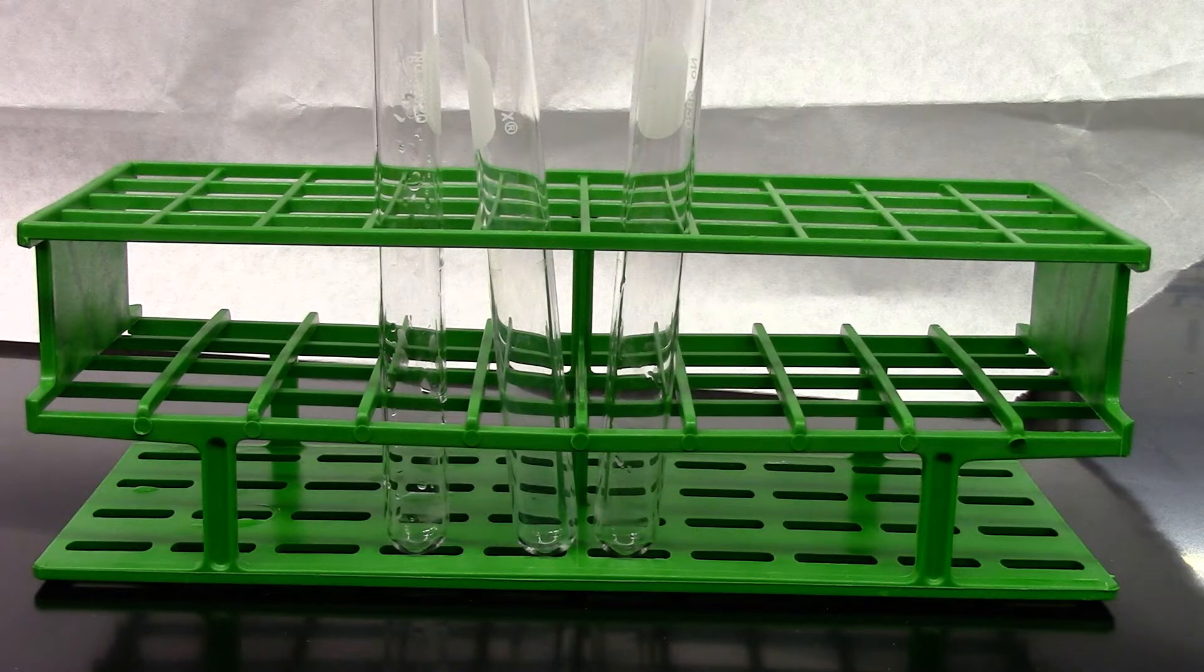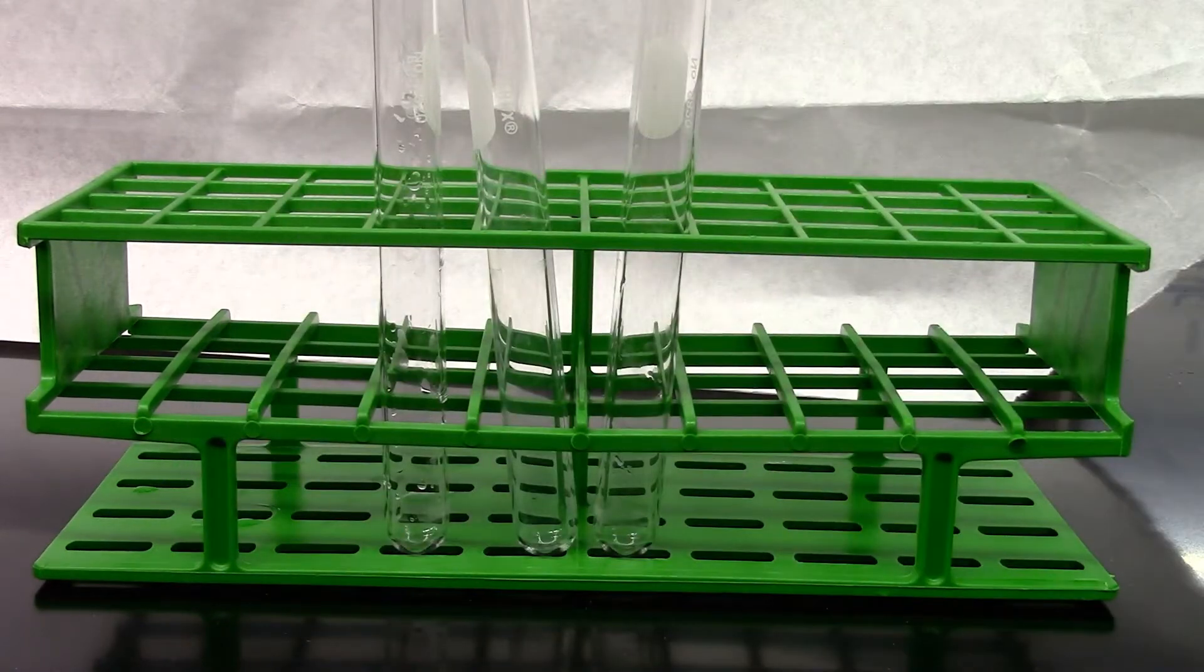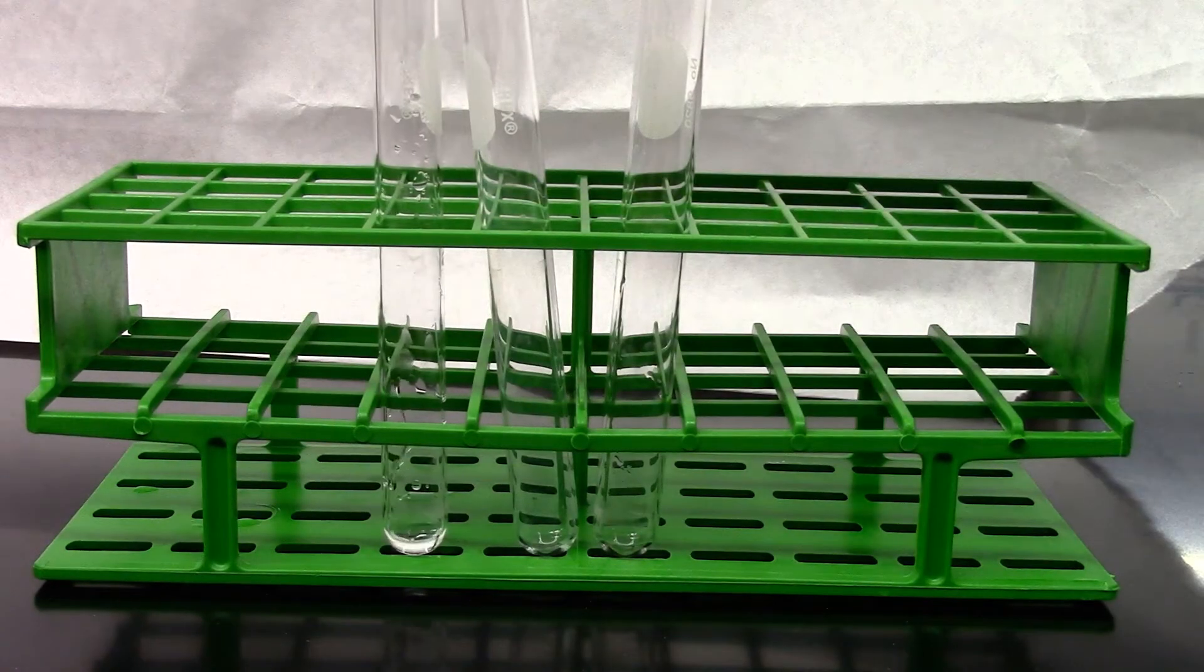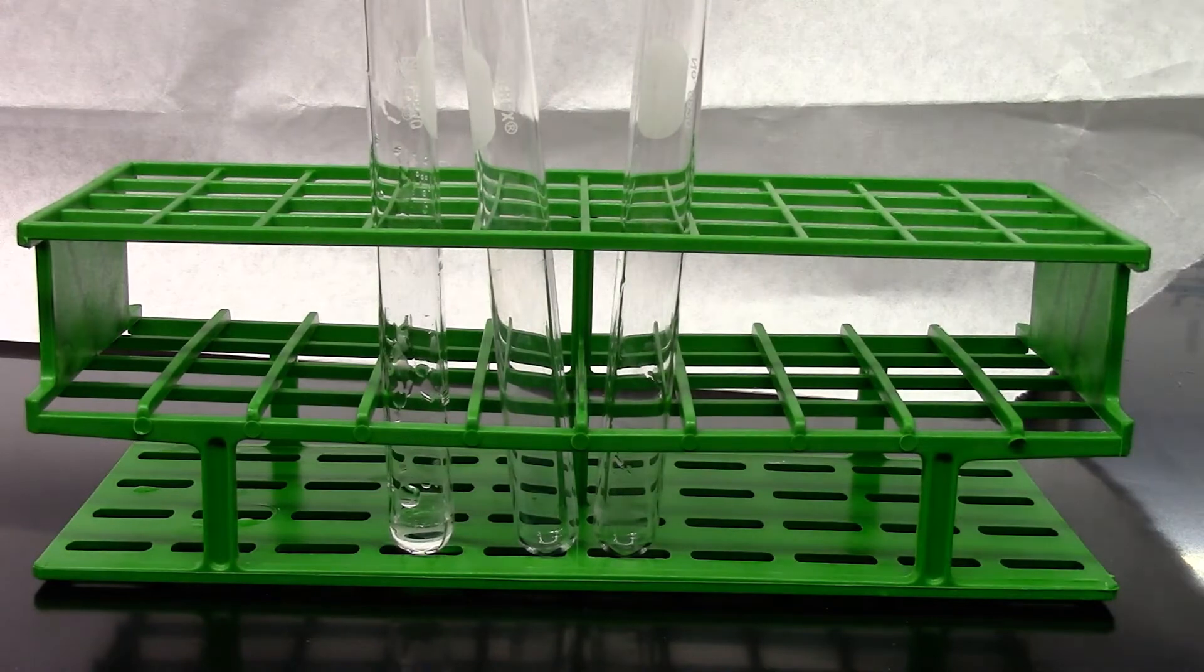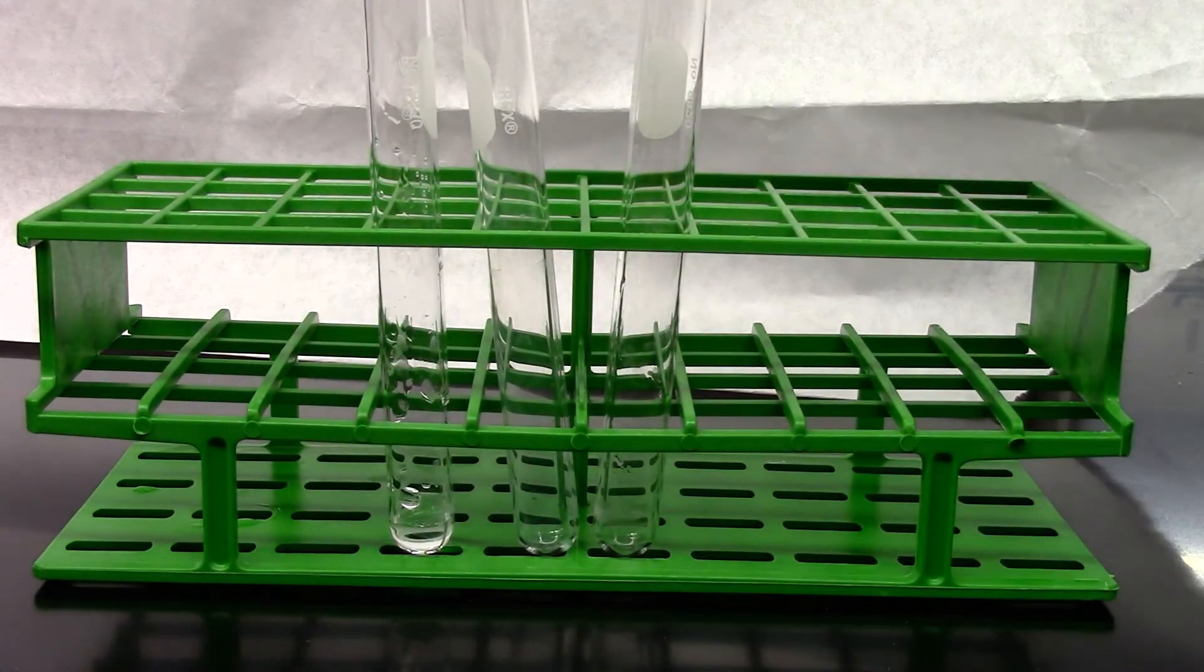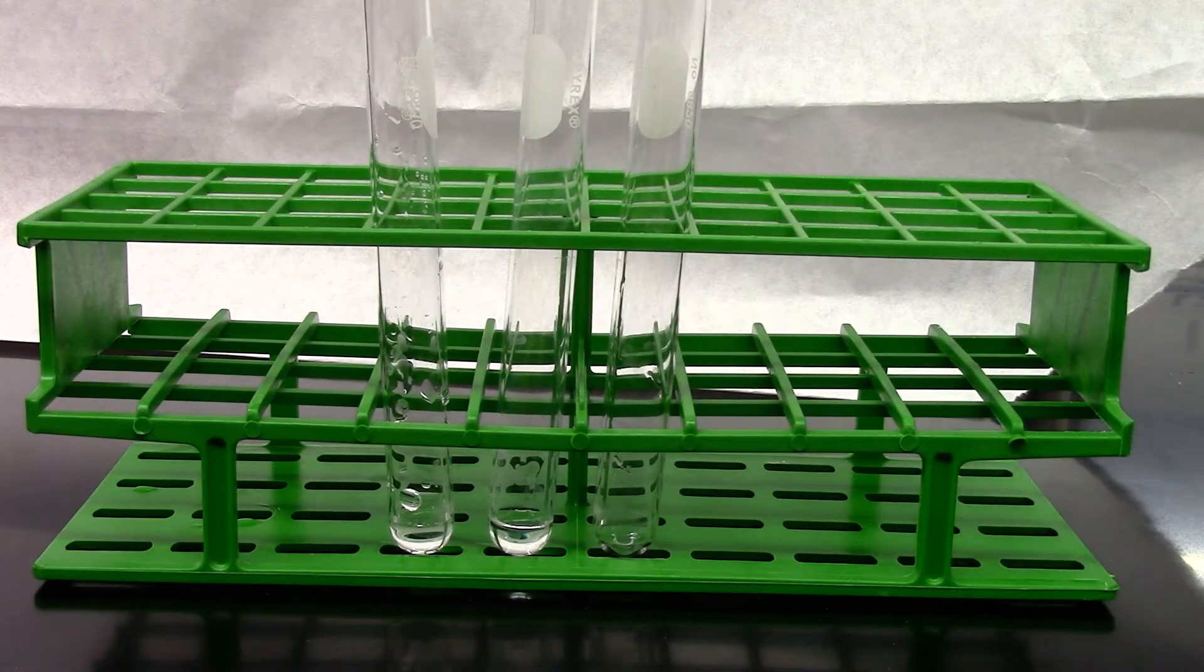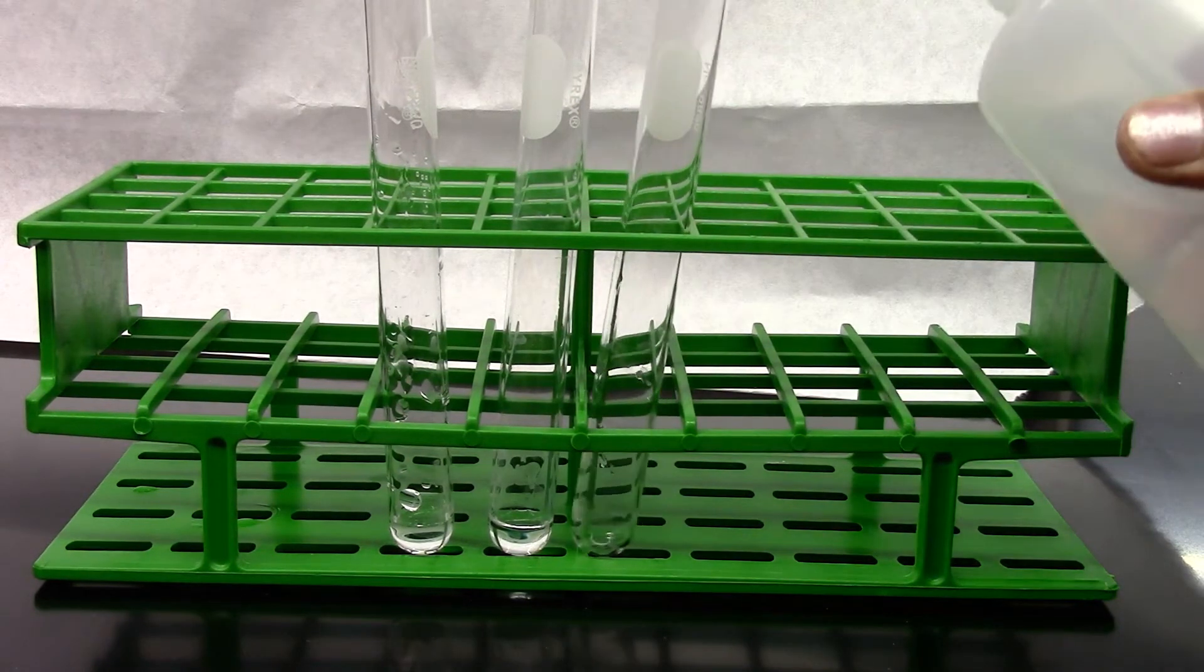So for part C I have three test tubes. The first one I'm going to add 20 drops of silver nitrate. The second test tube I'm going to add 20 drops of dilute hydrochloric acid. The third test tube I'm going to add 20 drops of DI water.